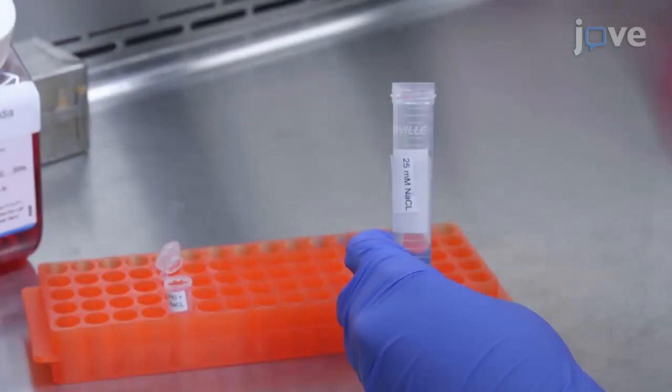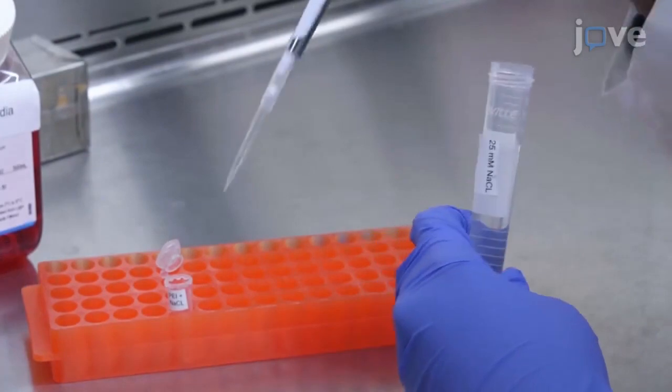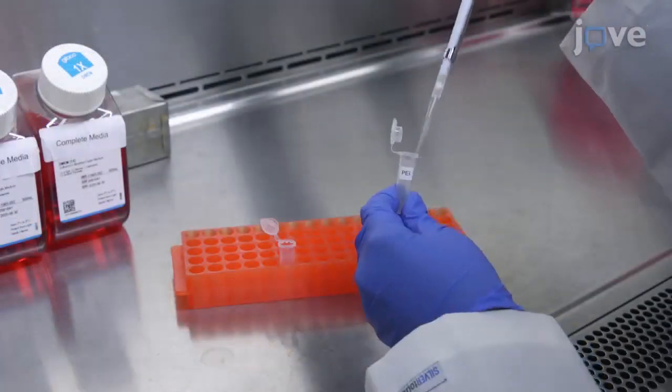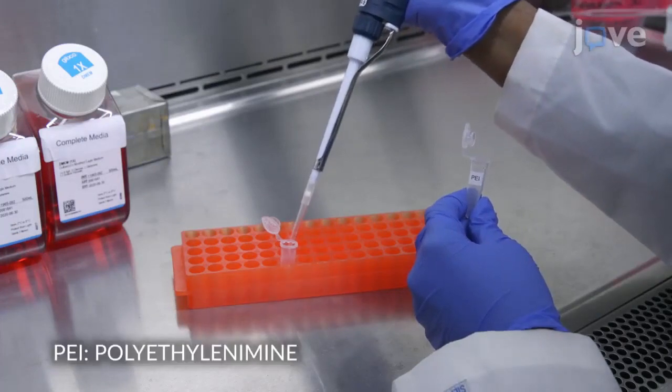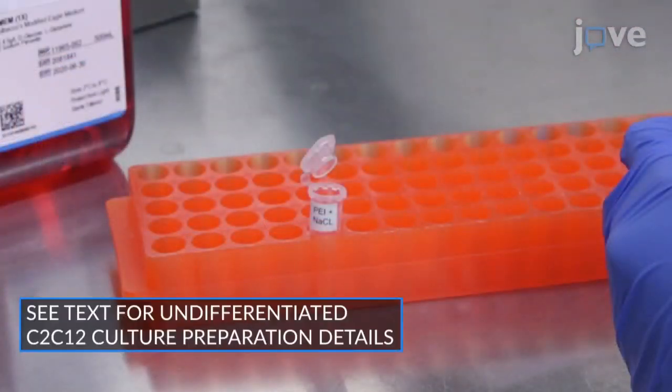The next morning, combine 100 microliters of 25 millimolar sodium chloride in one 1.5 milliliter reaction tube per culture well with 25.5 microliters PEI stock solution for a five-minute incubation at 37 degrees Celsius.